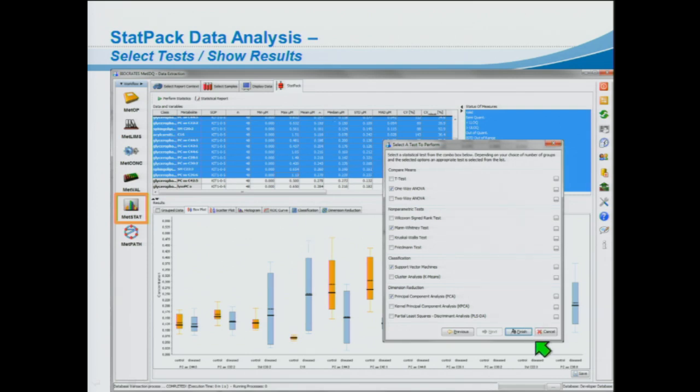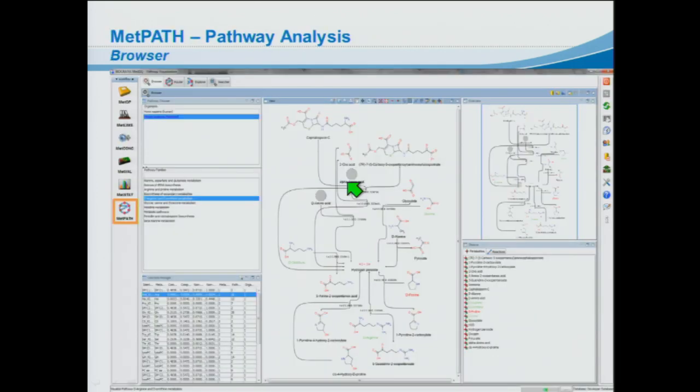So when we click on finish here in this table, the p-values are added for these tests, and then you can select here the metabolites, and while selecting the metabolites, you get here the box plots. You can then export the data here into a PDF as a statistical report, and all the information which is here in the user interface is then in a PDF file.